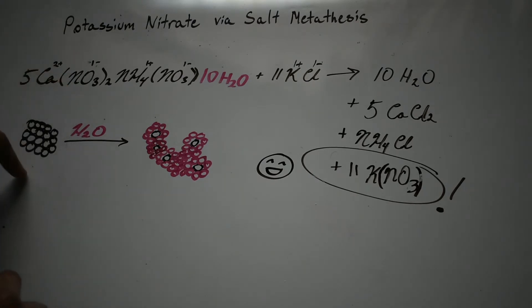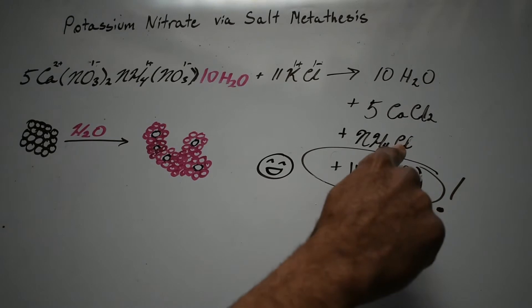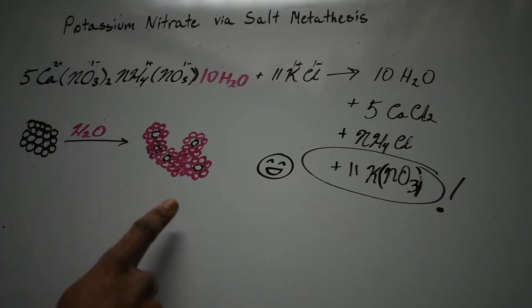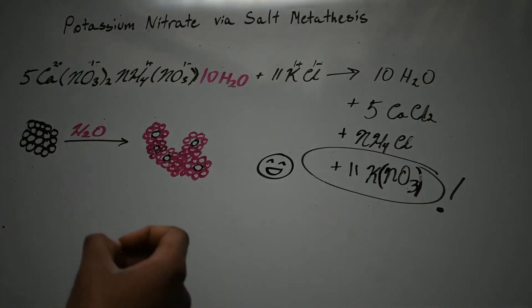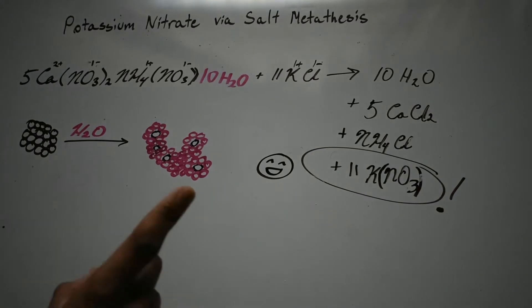So we're going to dissolve it in some water, boil that water, then add the potassium chloride and boil again to make sure everything is dissolved and all the ions are mixed. Then once we start cooling it down, the three products we have - calcium chloride, ammonium chloride, and potassium nitrate - have different solubilities. Once we start cooling it down in the freezer, they'll start to come out as solids, and the first one to precipitate should be potassium nitrate, which is what we want.